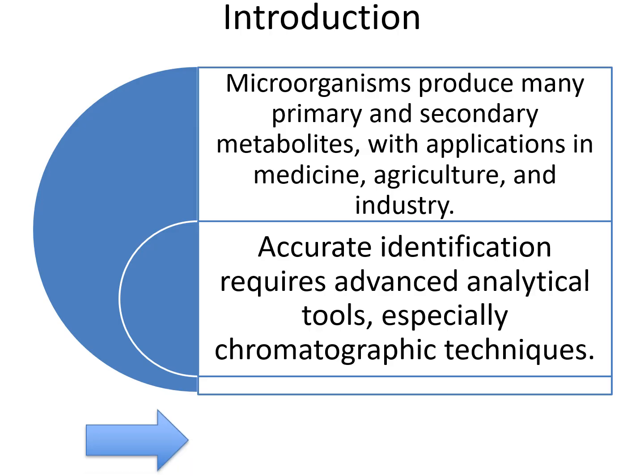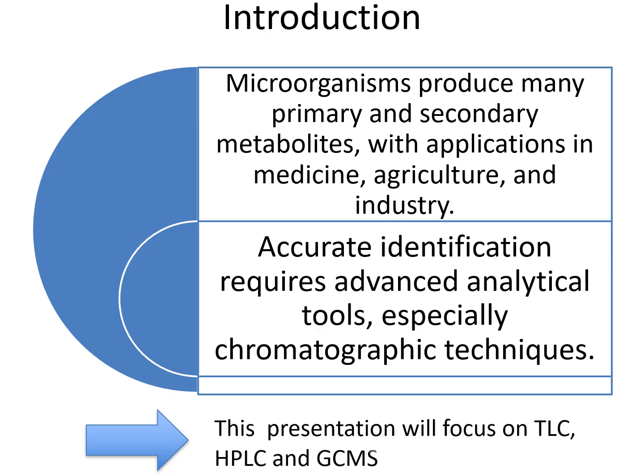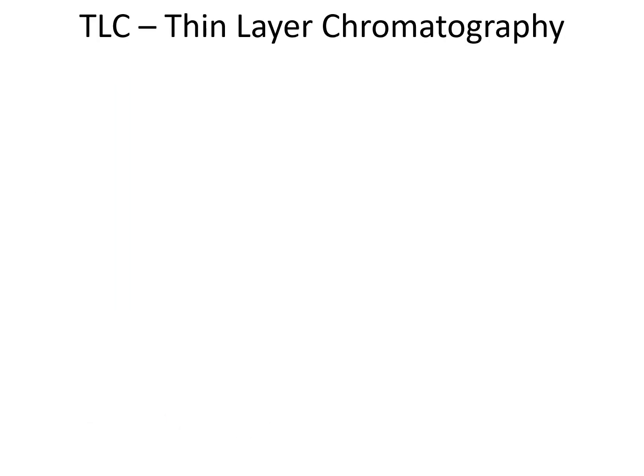Now, in this presentation, we are going to focus on thin layer chromatography, high performance liquid chromatography, and gas chromatography-mass spectrometry. Taking the first technique, which is thin layer chromatography.